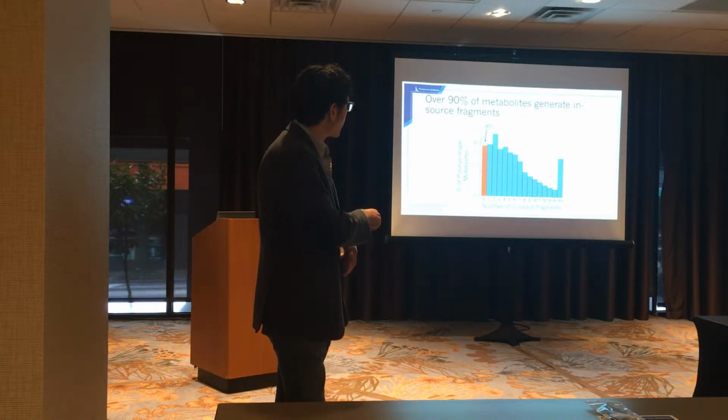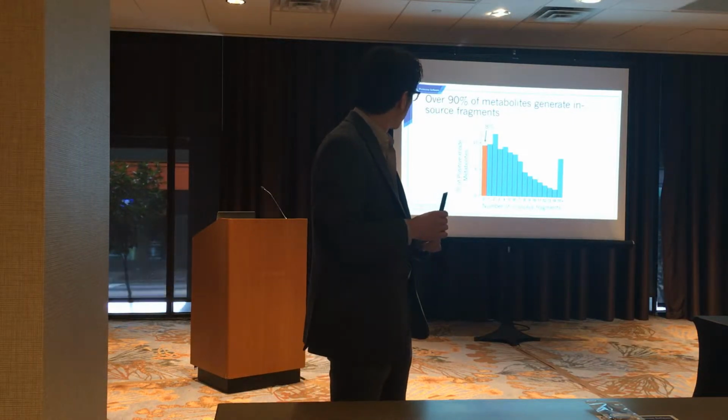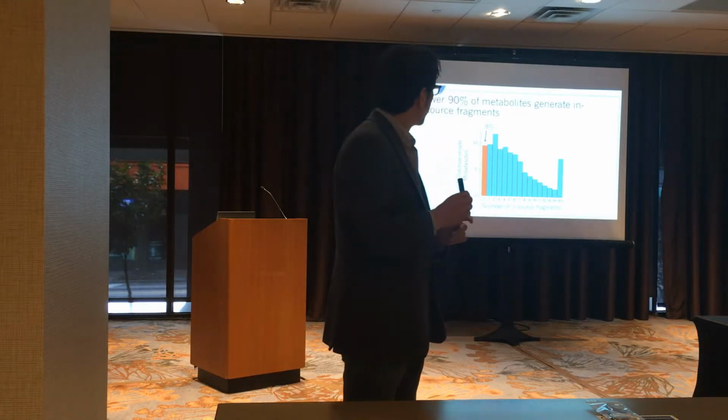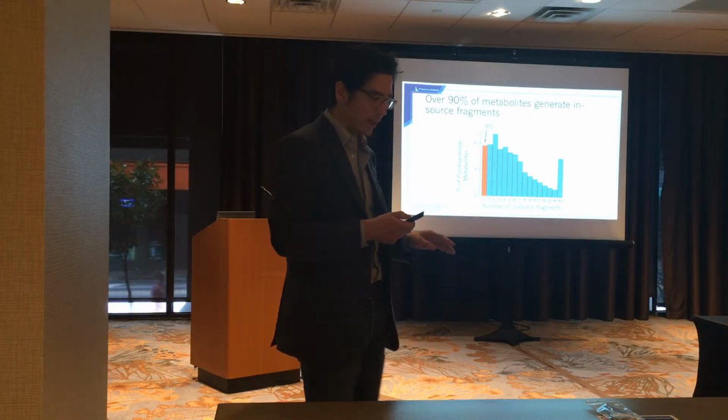So there's only 8%, I guess this is in the positive mode, of metabolites that actually show no in-source fragments whatsoever of any kind.